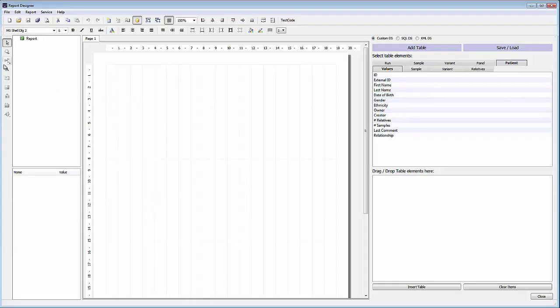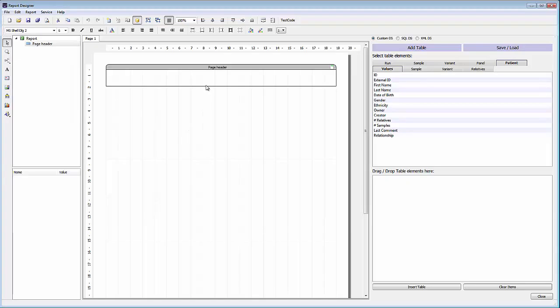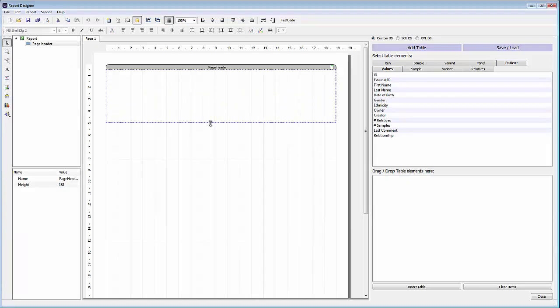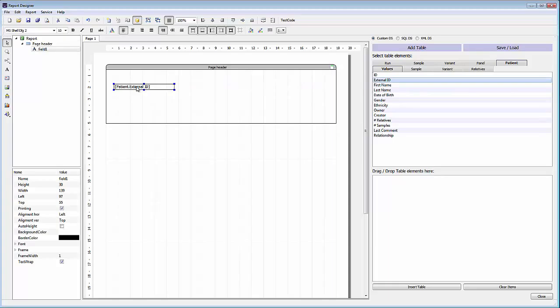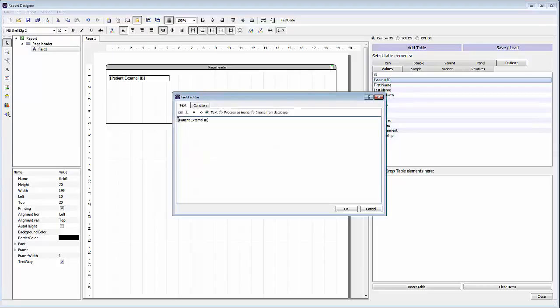To start off the report we'll add a page header. We can add this band and then resize it to make it a bit larger. For this example, on the left side of the page header we're going to add some patient information. We can add any of the patient information from the top right section. First we'll add an external ID — click and drag to add the field into the page header. You can click on the field to change its location, and then double click on the field to enter any additional text. For example, we can add a tag that says ID, and then following that ID tag the patient ID for the individual will be shown.